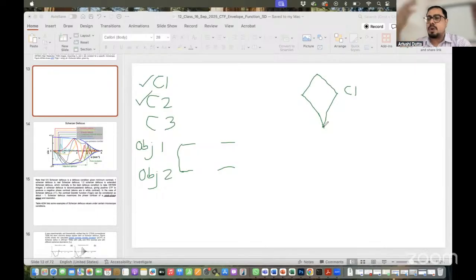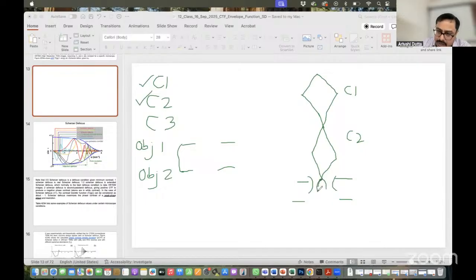Then after the C1 lens, what do you have next? You have the C2 lens. C2 lens is basically your intensity lens. Now, if I have the C2 lens, it is going, and then you can get a crossover point somewhere here. Now, your objective lens is here, these two lenses. If your crossover point is here, you are keeping a magnetic field in such a way that you can make the beam go in this fashion, okay? And it will go like this through your sample.